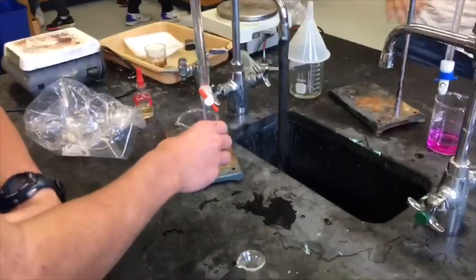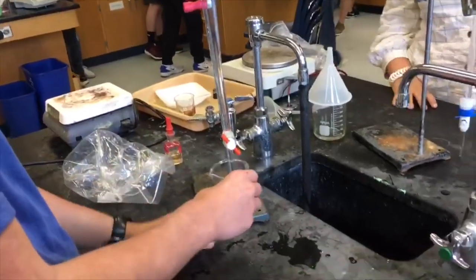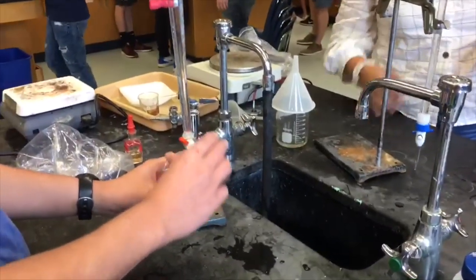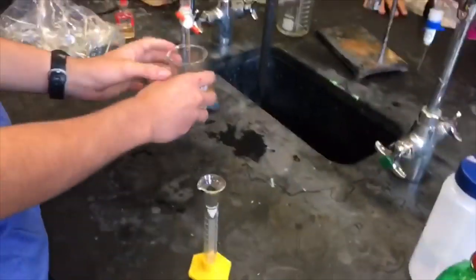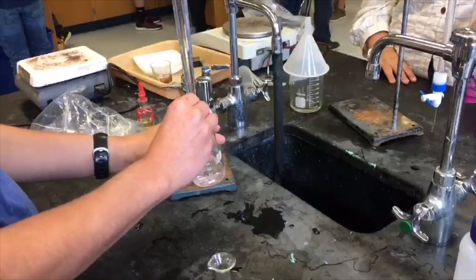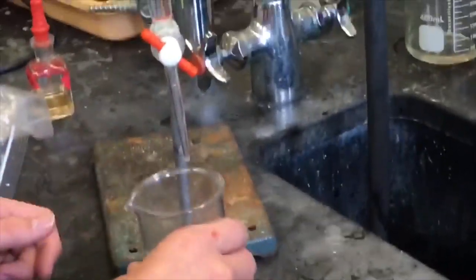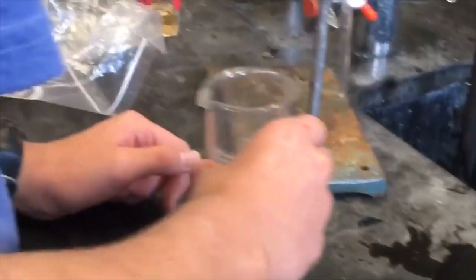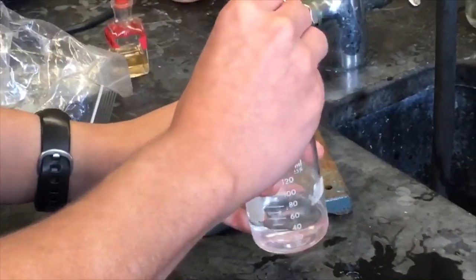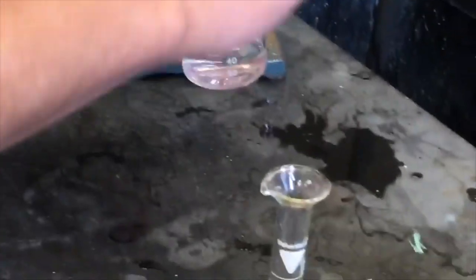molar of sodium hydroxide. For our procedure, we filled the burette to 0 with 0.1 molar of sodium hydroxide, measured 10 milliliters of soda into a beaker, and added 4 drops of our indicator. Then we slowly added the sodium hydroxide to the soda while constantly swirling it. Once the solution stayed a light pink, we recorded the final volume of sodium hydroxide in the solution.